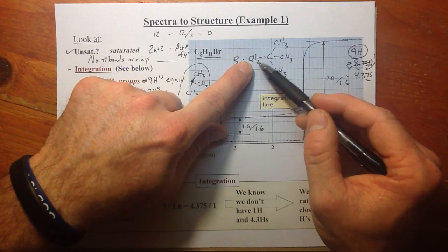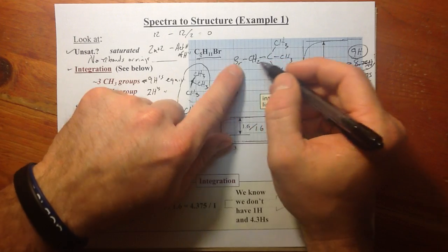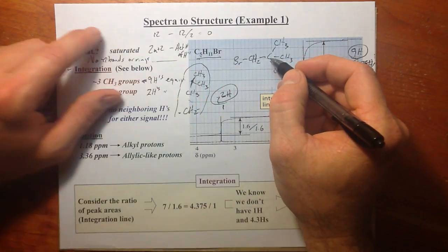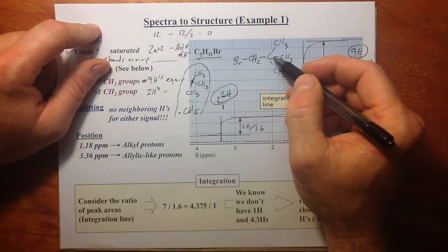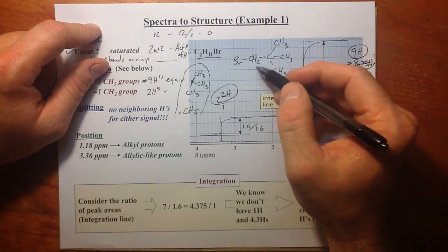Now the CH2 group, same thing. Take a walk, take any one of these 2. Of course, there's no splitting from the left. We go to the right here. There are no protons off this carbon, so there's no splitting for these 2 protons. We have a nice singlet.